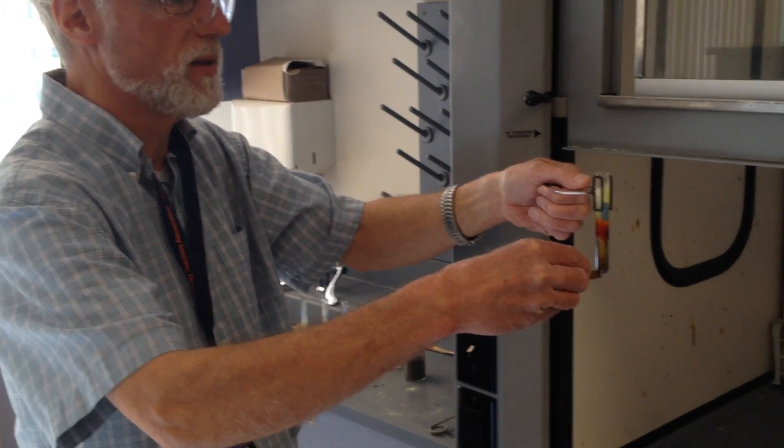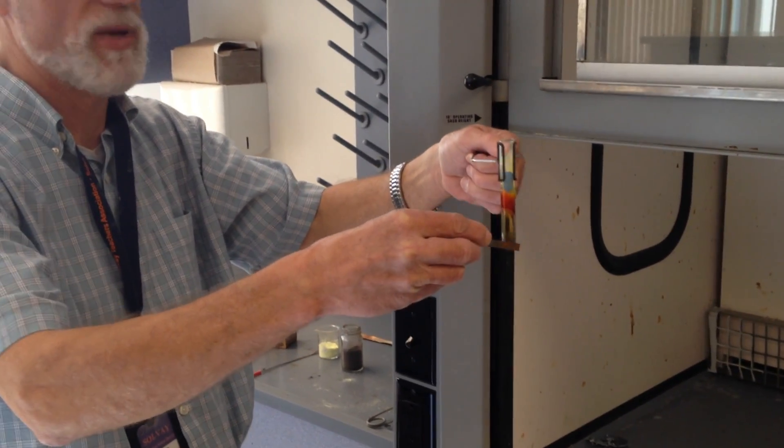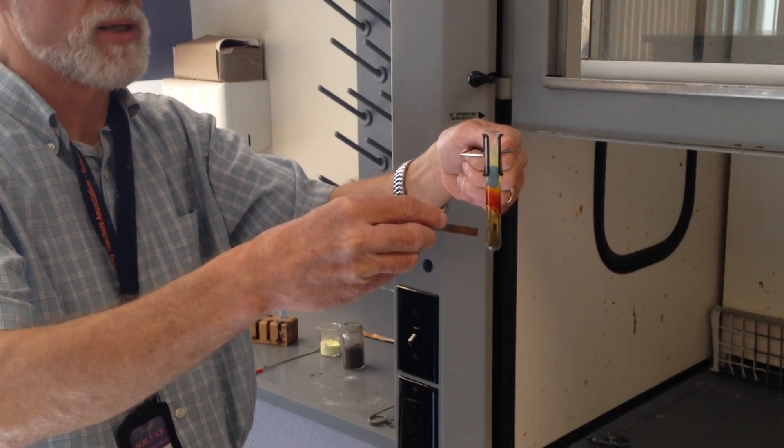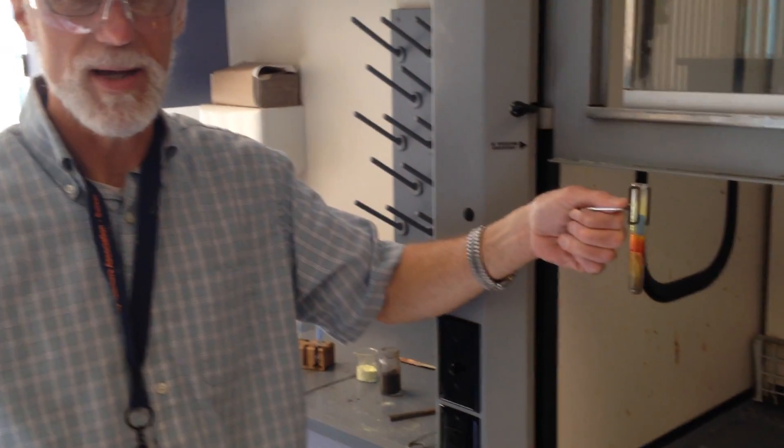We end up with a black solid at the bottom of the test tube, which, when tested with a magnet, is no longer magnetic. Notice there's nothing jumping to the magnet — you don't feel anything magnetic. The end.